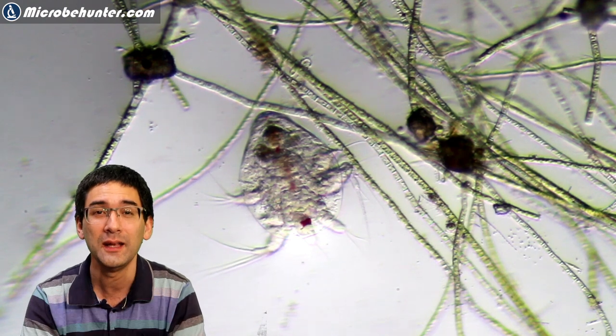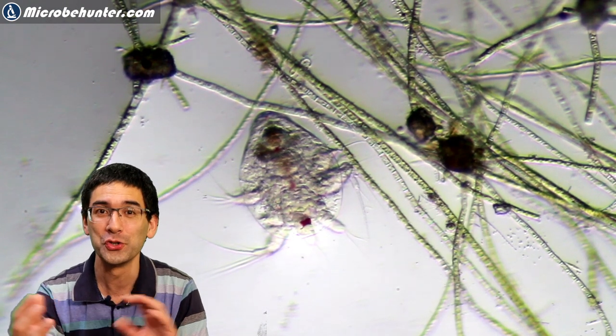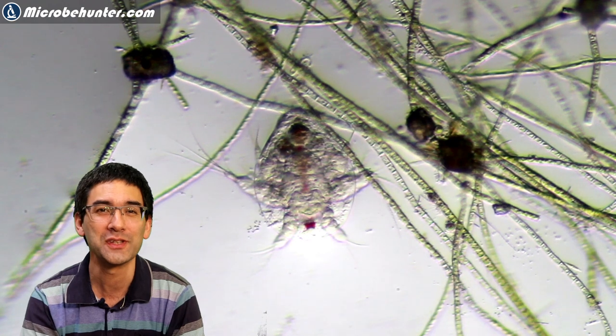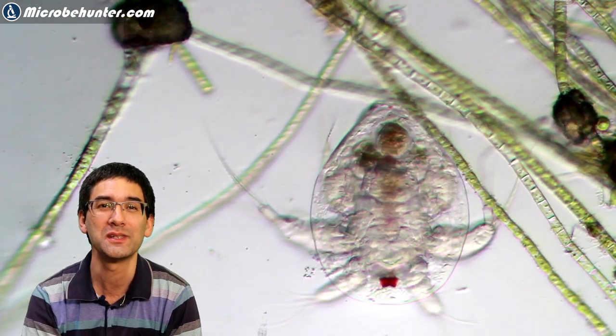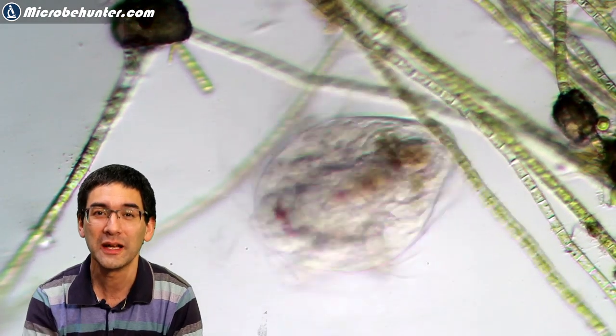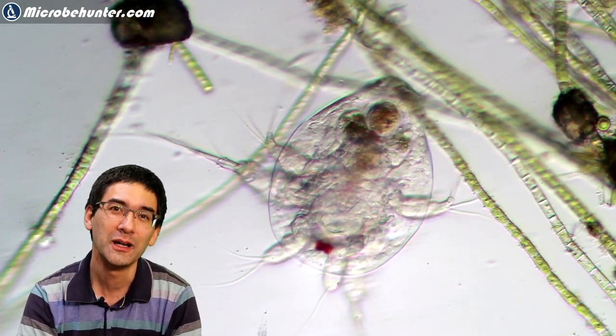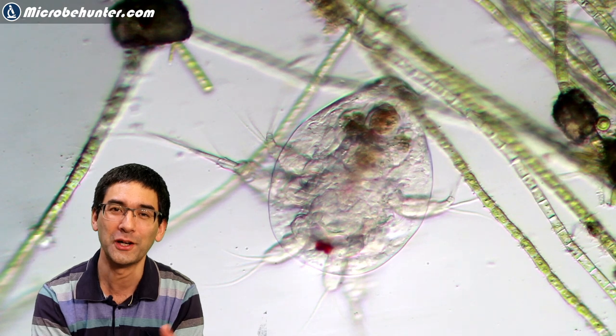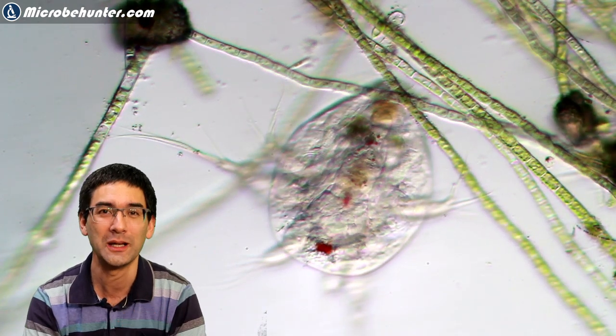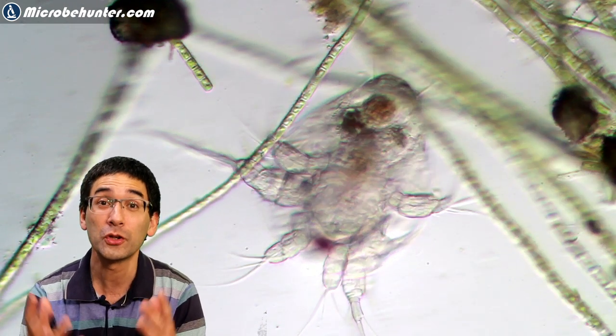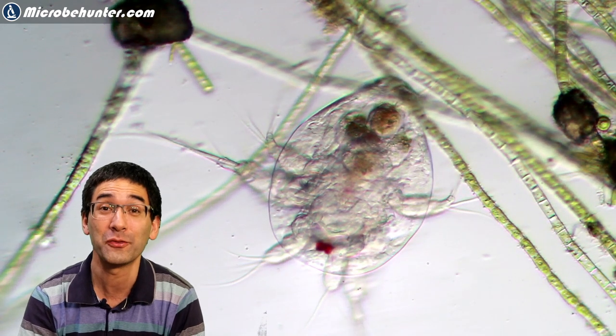The organs are also moving around—that's one of the nice things about these organisms. They're called water fleas because they move around in such a fast and jerking manner. They're related to crabs, crustaceans, and shrimp, as a matter of fact.